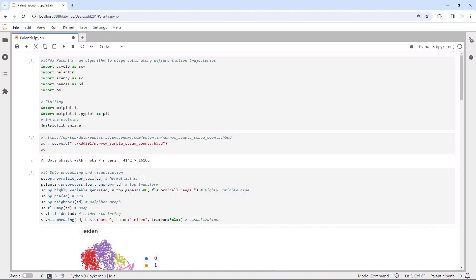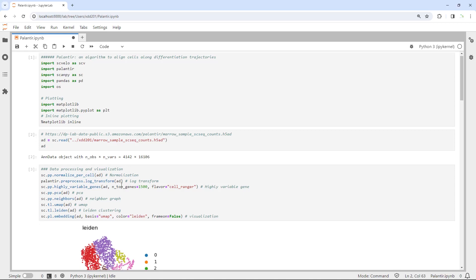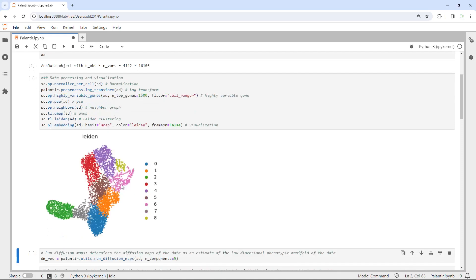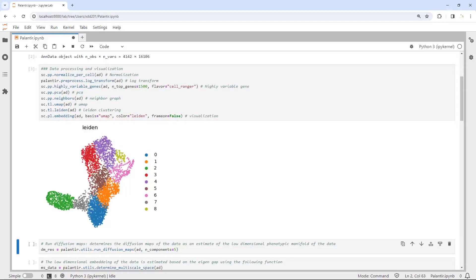Let's run the standard ScanPy workflow to process the data. Because we only have cells below 5,000 in this dataset, we can quickly run the workflow. You can see now we have 9 cell clusters in this dataset.